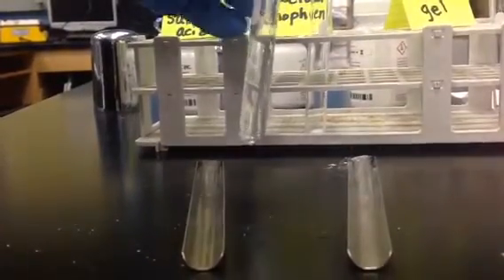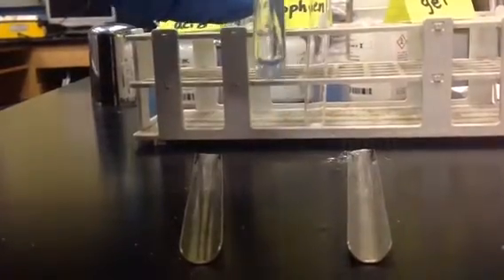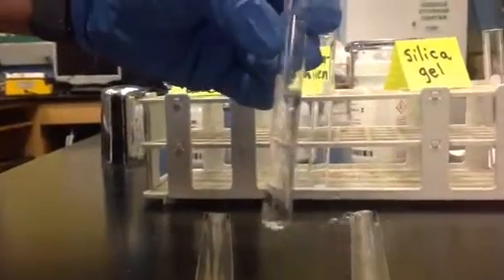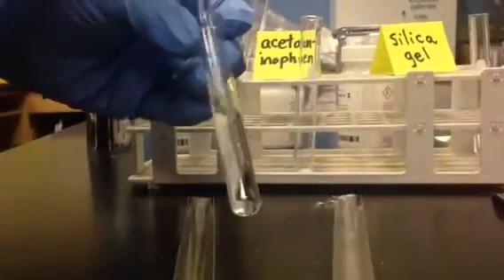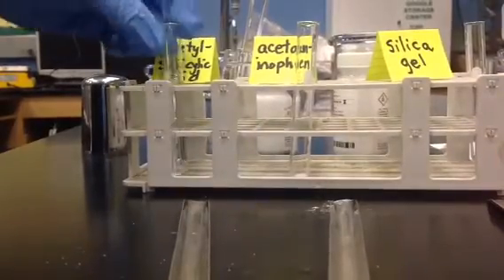It's really having trouble going in. But I definitely had more than just those few pieces of the acetylsalicylic acid. So to me, this is a definite that it's dissolving, it's just taking some shaking.